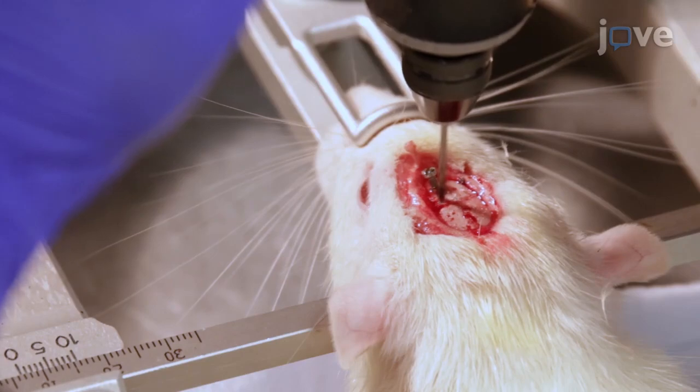Next, drill a 1 millimeter diameter reference electrode hole in the left hemisphere, 1.5 millimeters anterior.